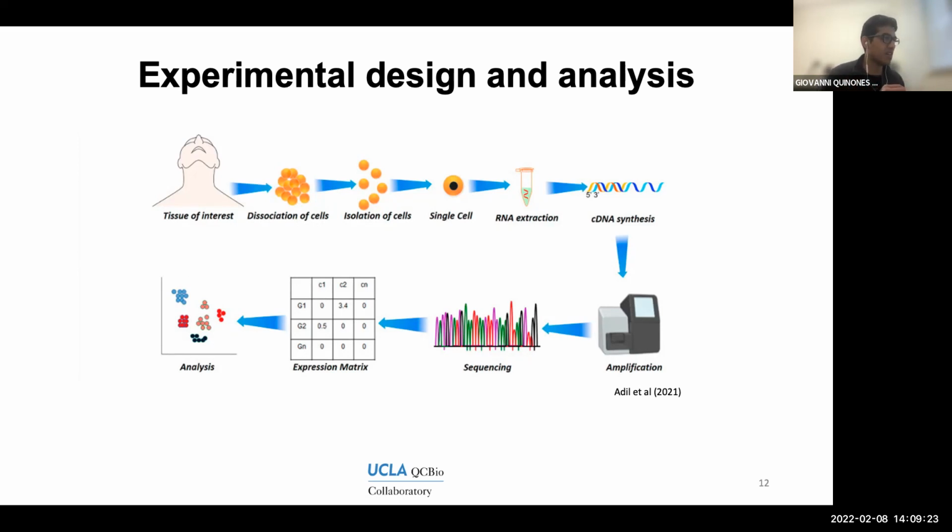They contain all these molecular bindings between cells that you have to break apart in order to get a suspension of cells, so you can have individual cells floating in solution. This dissociation is done in a number of different ways. A lot of times people use enzymes to break some of the extracellular components in order to dissociate the cells.